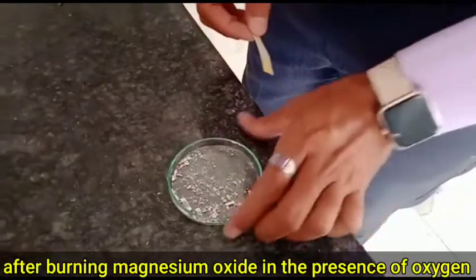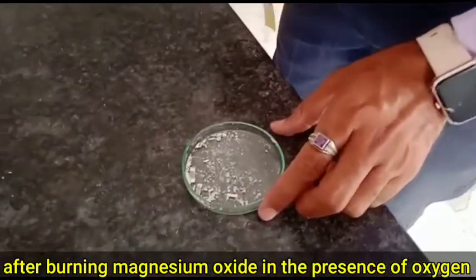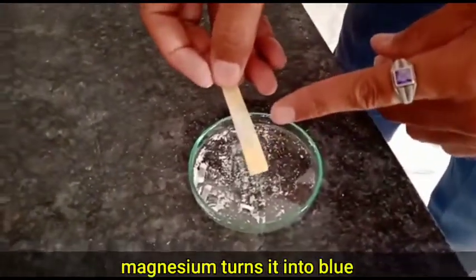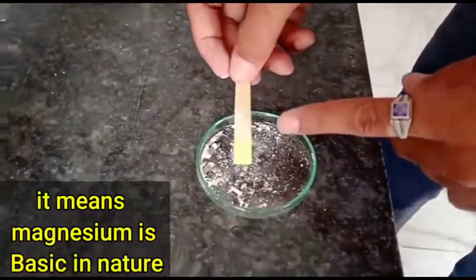This is Magnesium Oxide. Let's burn Magnesium in the presence of Oxygen and see. This is red litmus paper — Magnesium turns it into blue. It means Magnesium Oxide's nature is basic.